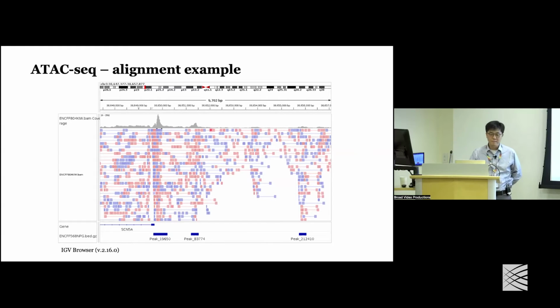Yes. So MACS2 is, as I said and as you said, one of the most popular tools to call the peaks. Even if it was originally developed for the analysis of different types of genomic data, ChIP-seq, it actually works really well for the analysis of ATAC-Seq. But you have to use a specific combination of parameters in order to make it work on ATAC-Seq.